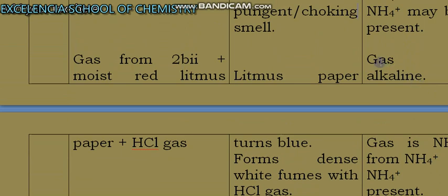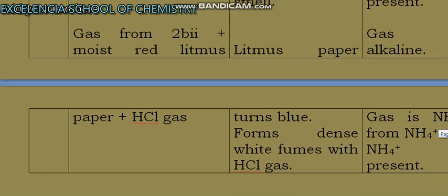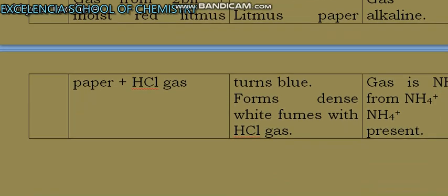Then gas is ammonia from ammonium ion—don't say ammonium ion is present, and don't say ammonia gas is present. Gas is ammonia from ammonium ion, so ammonium ion is present.